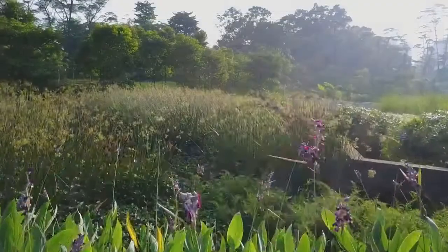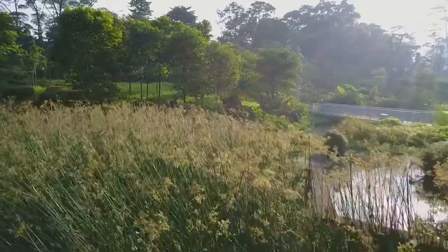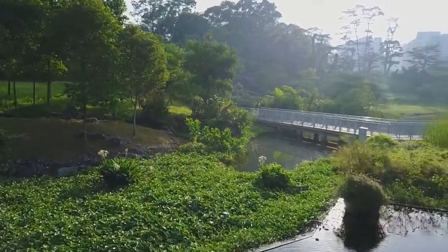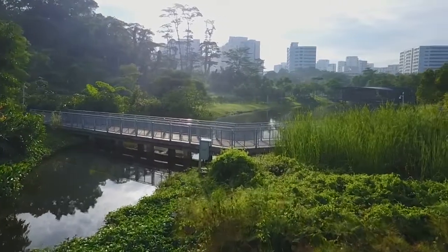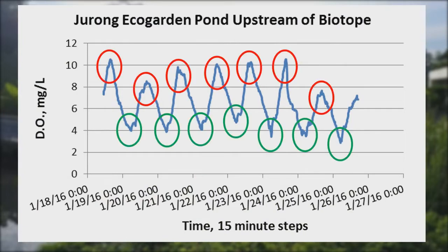The advantage of continuous monitoring is that it can place manual grab samples in a temporal context. For example, if we take a grab sample of water for dissolved oxygen at 8 a.m., we won't know what the dissolved oxygen is at 4 p.m. unless we stay on site the entire day or come back to collect a sample. From this graph of the YSI output, however, we can see how dissolved oxygen varies through the day or from day to day.